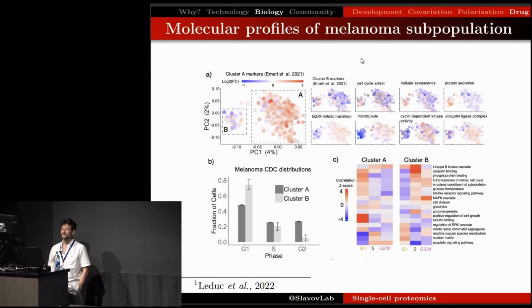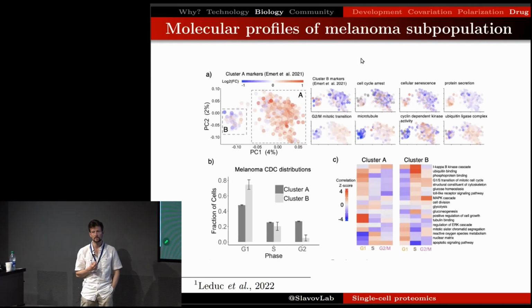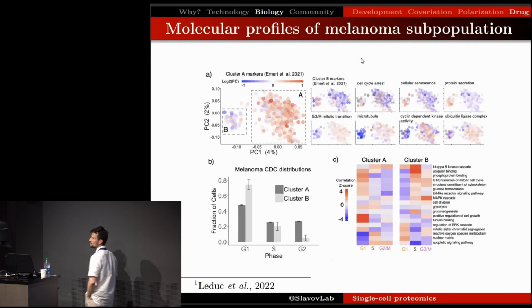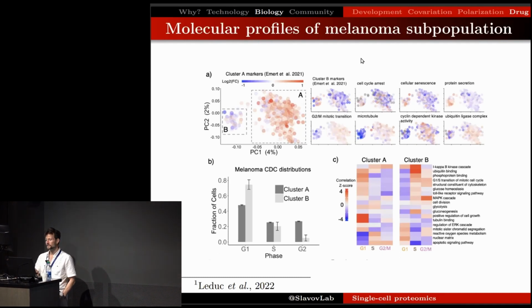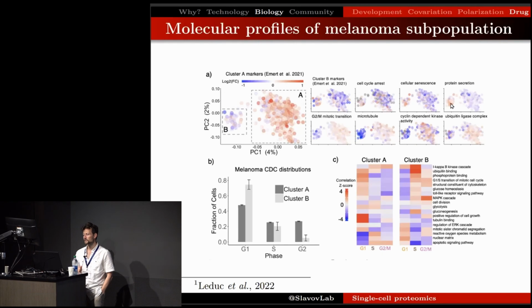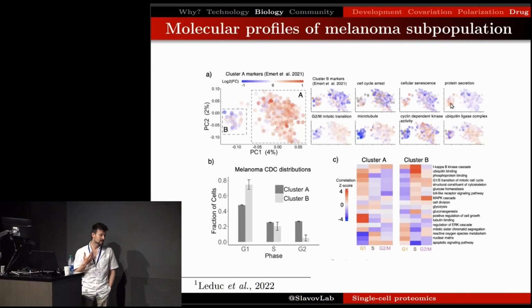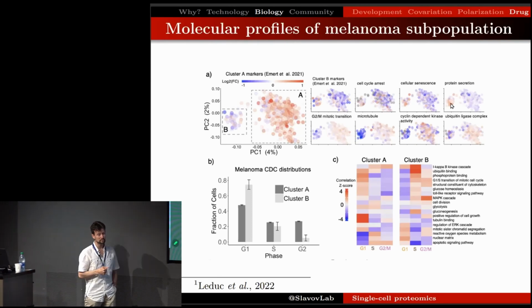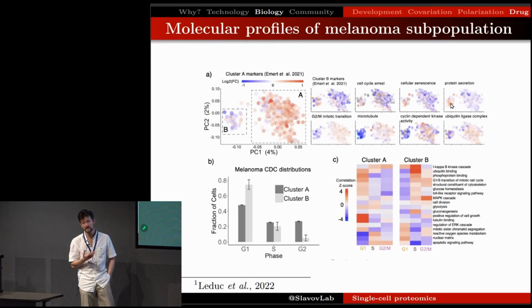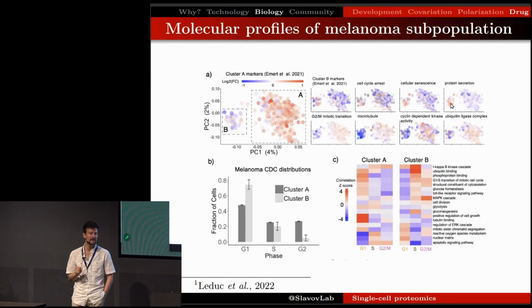There were a number of additional functional sets of proteins that showed enrichment in those clusters. In particular, the larger cluster had enrichment for proteins associated with cell division, and the smaller cluster was associated with proteins functioning in protein secretion and so on. Whenever you do single cell measurements, there exists a possibility of inferring cell cycle information without doing any additional work.